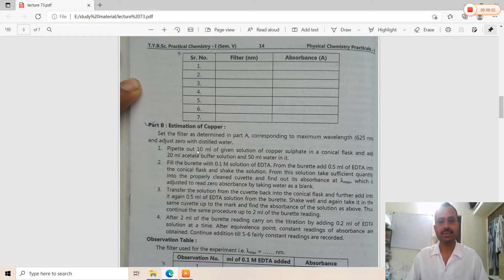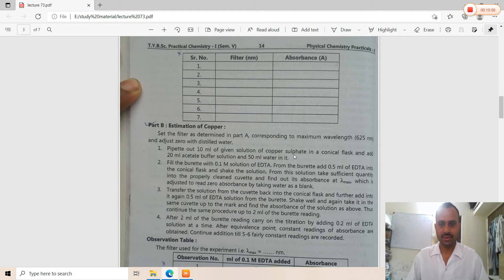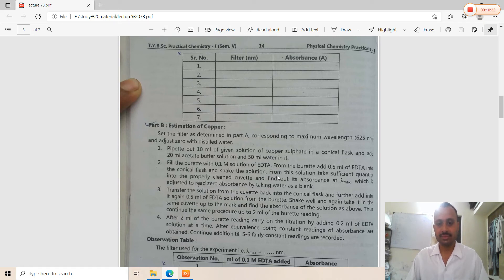Part B — Estimation of copper: Pipette 10 ml of the given copper sulfate solution into a conical flask. Add 20 ml of acetate buffer solution and 50 ml of water. Fill the burette with 0.1 molar EDTA. Add 0.5 ml of EDTA from the burette into the conical flask. From this first reading solution, take a sufficient quantity into the clean cuvette and measure its absorbance at lambda max, with water adjusted to read zero absorbance as a blank.